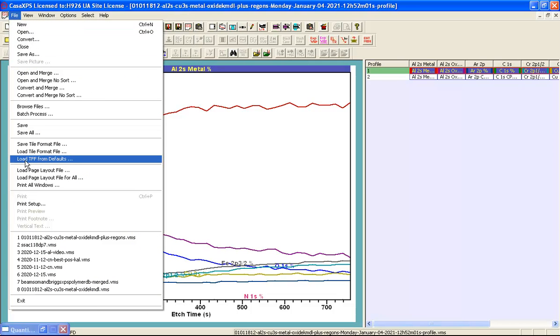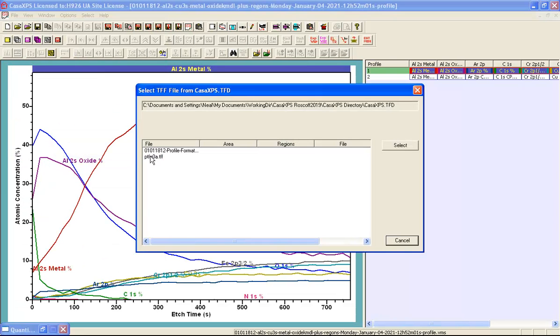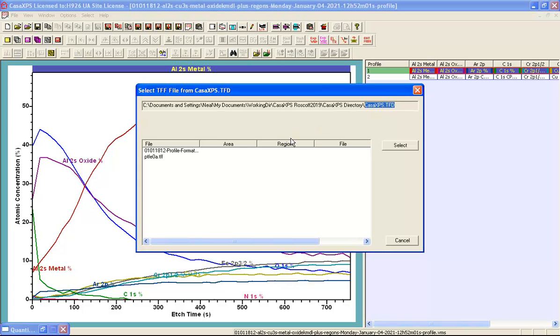There is the load TFF file from defaults and this is a set of TFF files that have been placed in a very specific directory. It is the directory that is in the CASA XPS directory that is called CASAXPS.TFD that is tile format directory and these TFF files contain the display state for different formats of data.